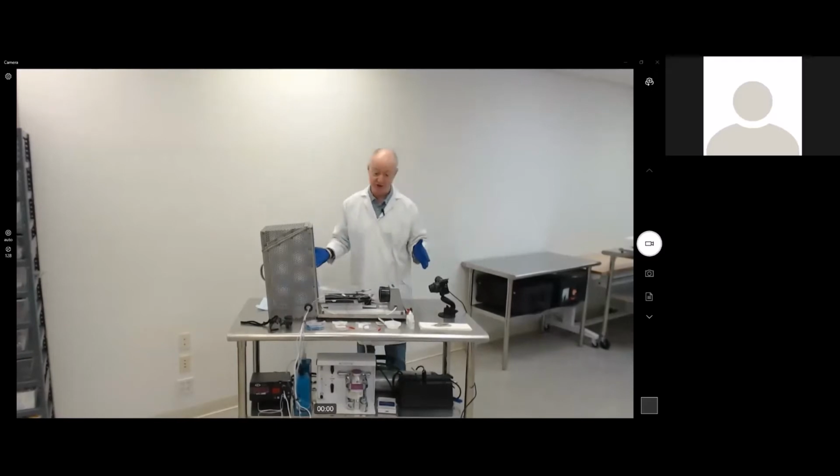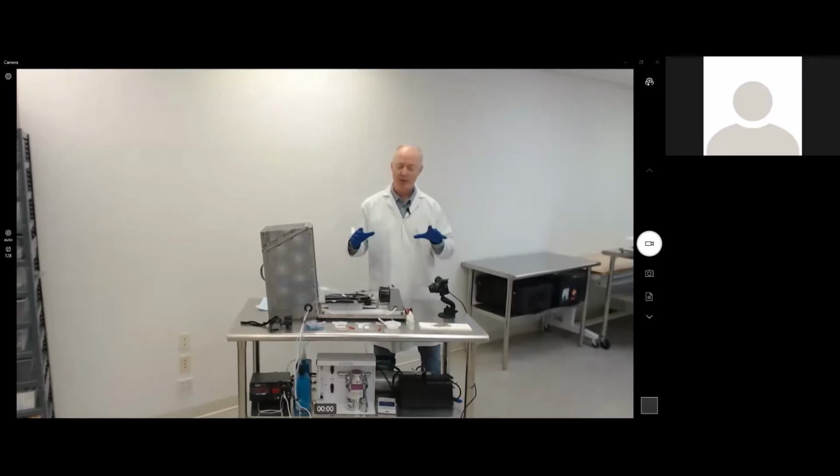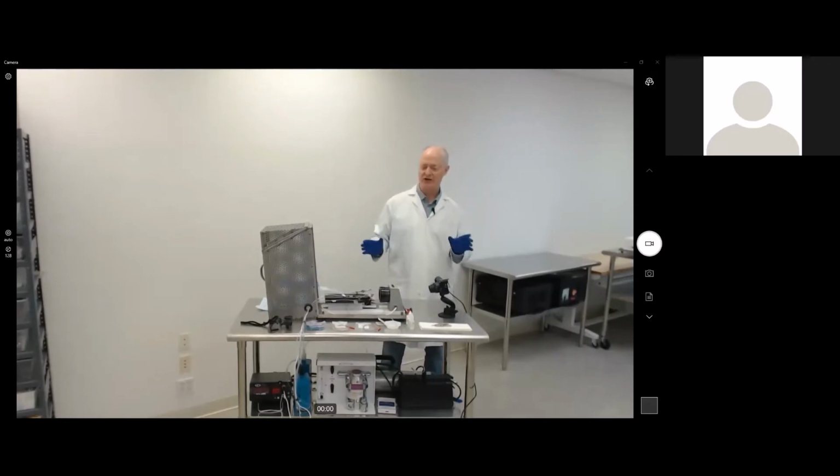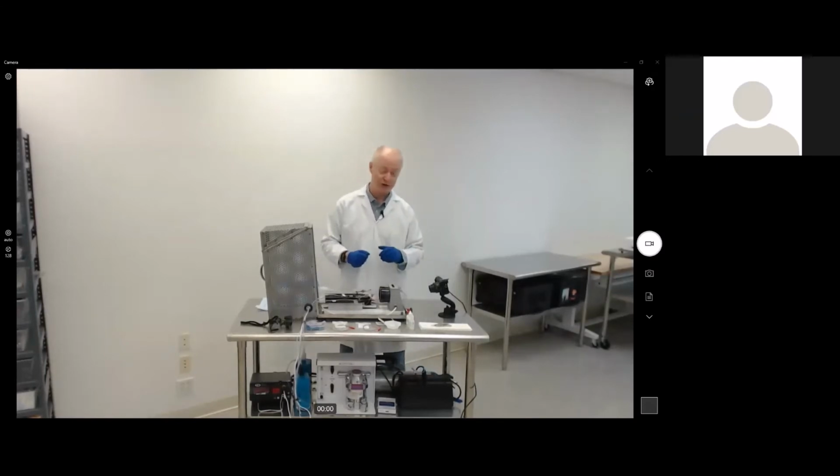As you can see in our system here, the OcuScience system is fairly small and compact. But in general, ERGs all have some very common components. One of which is, of course, a Ganzfeld dome, the ability to flash light. This is a very small dome, but it's still big enough to do both eyes of the mouse or a rat at the same time. There are other systems with much larger Ganzfeld domes for doing full field ERGs, but this is the configuration we have.